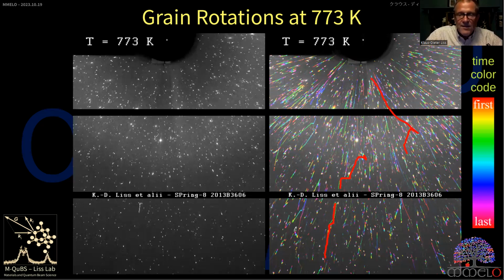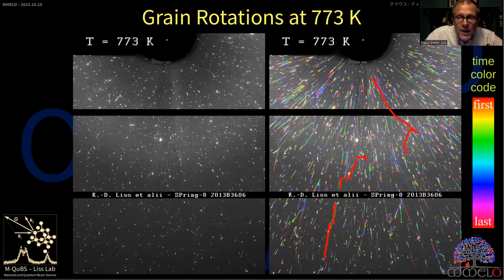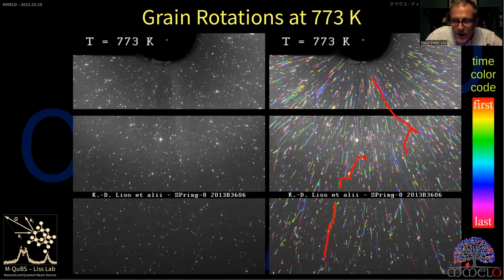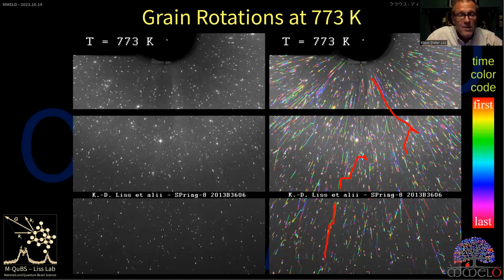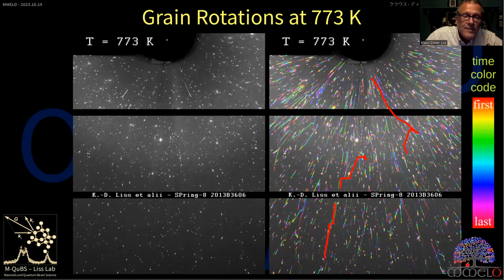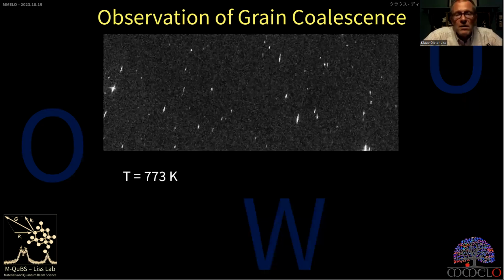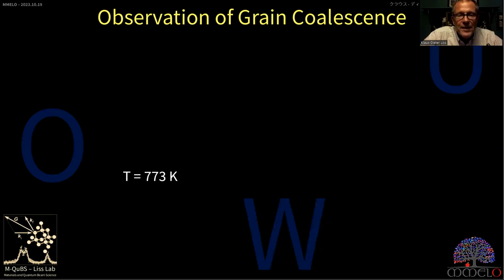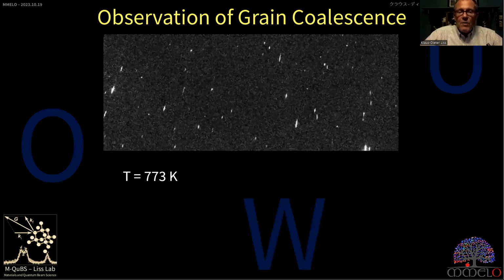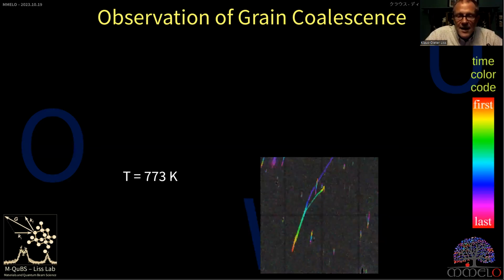So these grains move and reorient, the reflections move, the grains reorient. Only a few of them reorient. Most of them remain static in the matrix. Here we look at another detector which zooms in a little bit. What we see there, I put it onto the color time scale again.